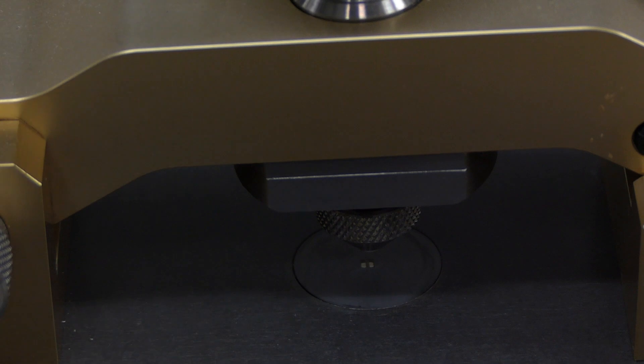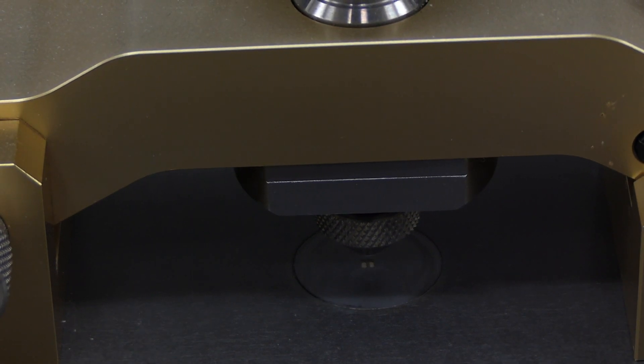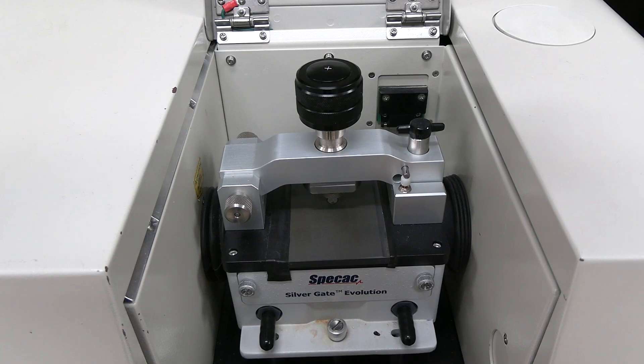Ensure the anvil does not come in contact with the sample window on the platform. The anvil could damage the window. The ATR could also look like this model and functions in the same way.